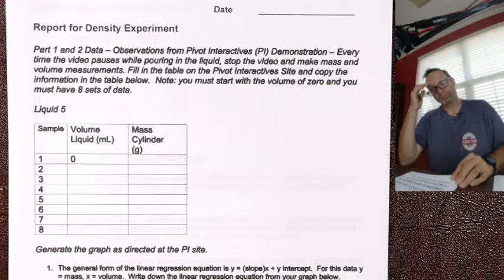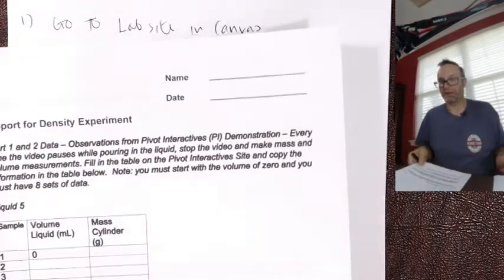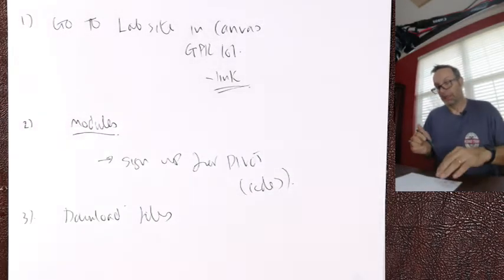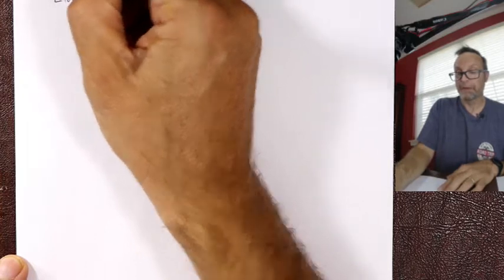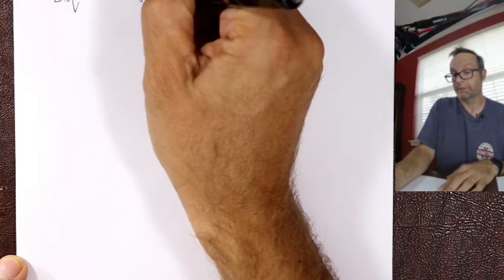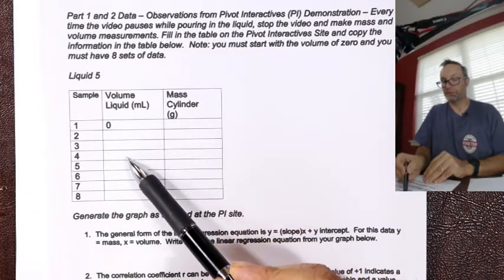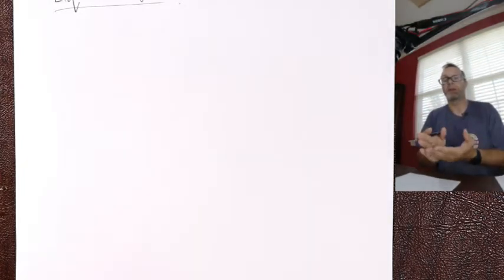All right, now let's get into some nuts and bolts. I'll talk out loud a little about the ways you solve these unknowns. For the liquid, you're using the graphical method. If you have the sheet in front of you, you have a bunch of different samples, a bunch of different volumes, and a bunch of different masses. So essentially you're weighing the same material a bunch of different times, and you get a table of volume and mass data.